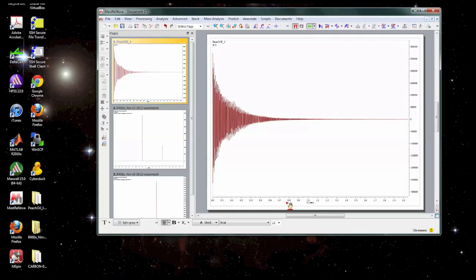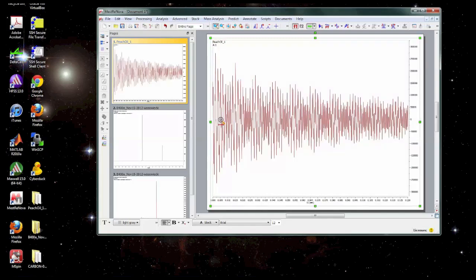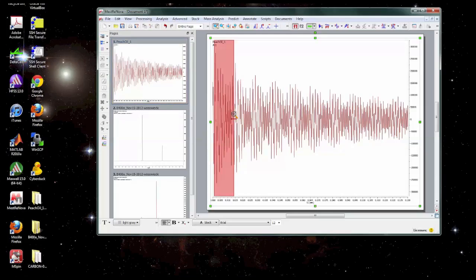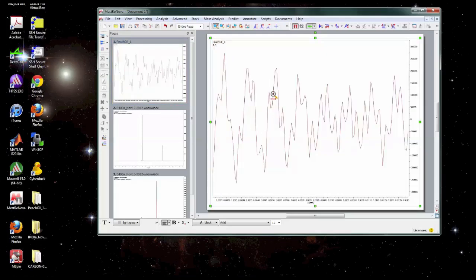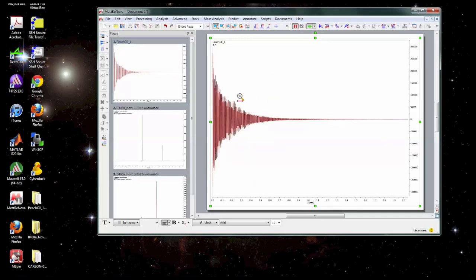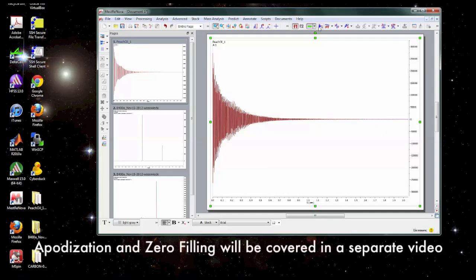So we collect the data as a free induction decay or an FID. It looks like this. It's a time domain dataset and the data is actually a bunch of sinusoidal oscillations which are very hard to interpret as a person.